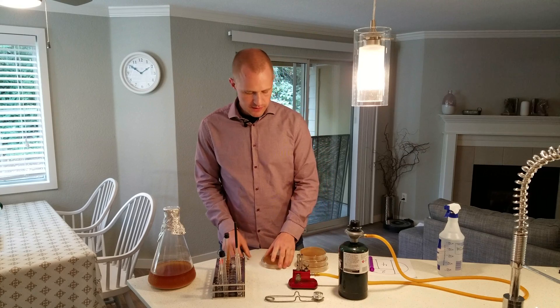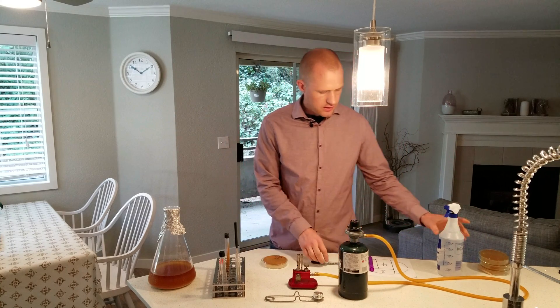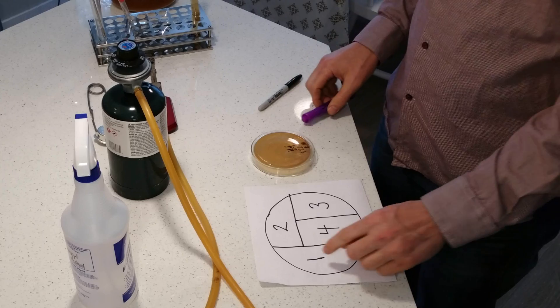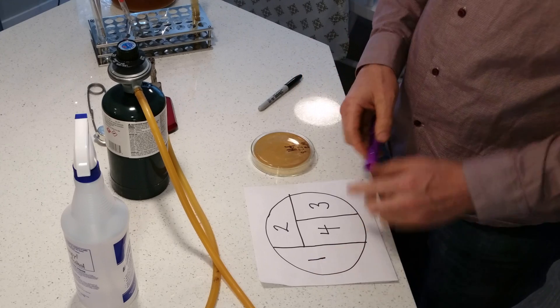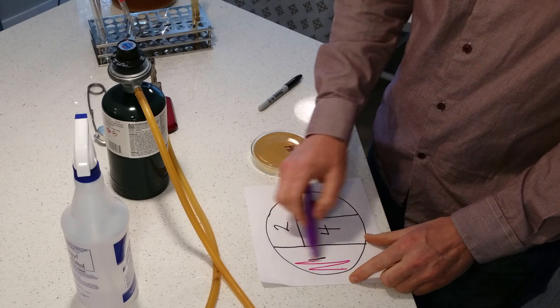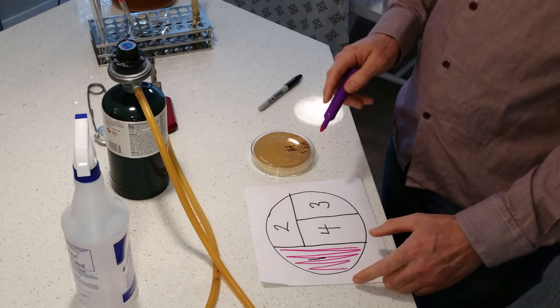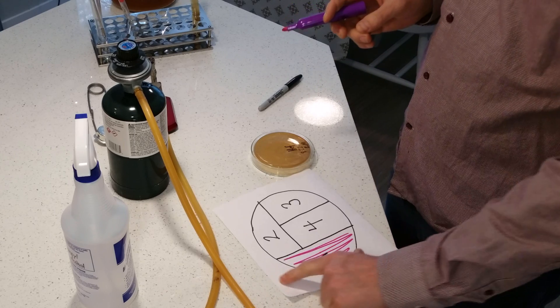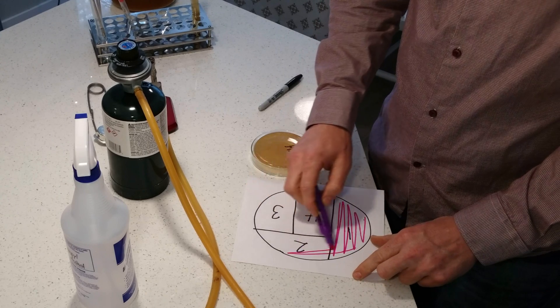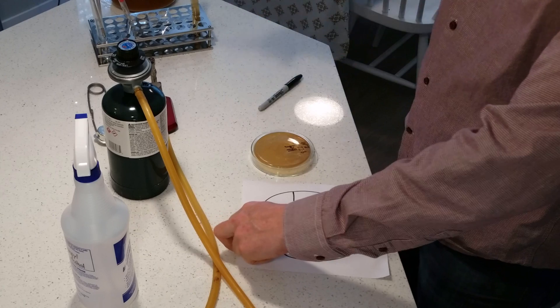We're going to leave the plate upside down until we're ready. What we're going to be doing is streak in a specific pattern by quadrant. We'll collect some yeast using the loop, put it on quadrant one, and streak it back and forth. Then we'll take the loop into the burner and burn off whatever yeast is there, turn the plate 90 degrees, go in through the previous yeast at least twice, and streak back and forth inside quadrant two.